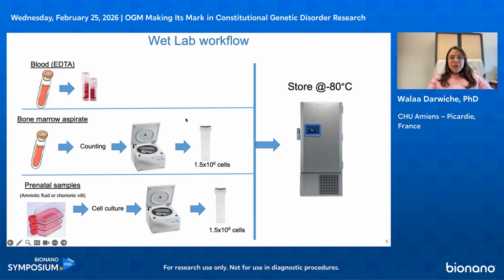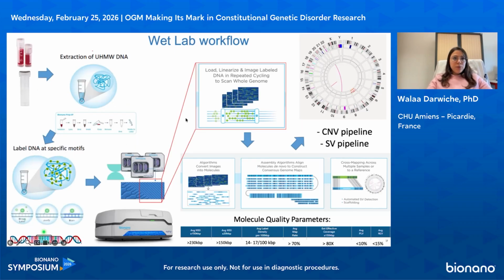So DNA extraction is performed on day 1 using frozen vials. The DNA is then stored at room temperature for 48 hours to allow homogenization. And on day 3, we quantify the DNA, perform labeling using Bionano labeling and stain kit, and proceed to scanning.